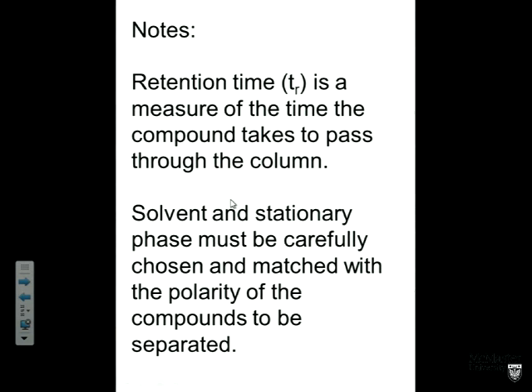So retention time is a measure of the time that a compound takes to pass through the column. And solvent and stationary phase must be chosen and matched to the polarity of the compounds to be separated.